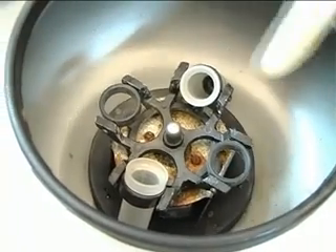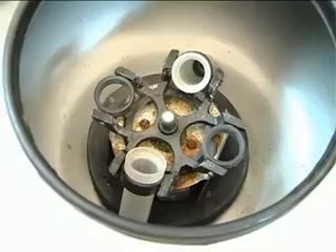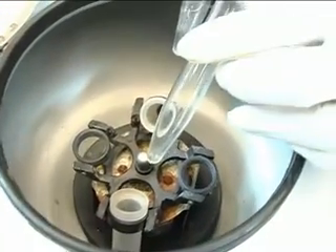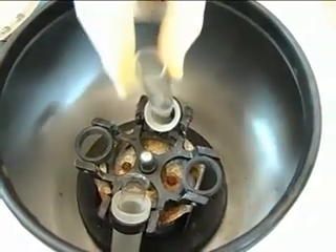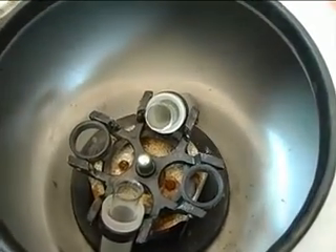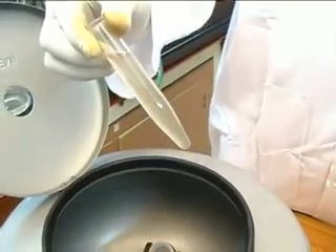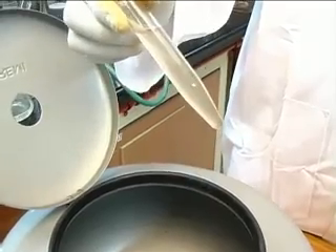The glass tube is the centrifuge tube in which the solution is placed. To balance forces during rotation, an empty tube or one filled with water is usually placed opposite to it.